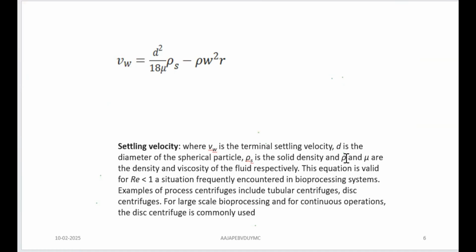And another important factor is viscosity. More the viscosity, more is the resistance. Alright. So viscosity of the suspending fluid also is very important.